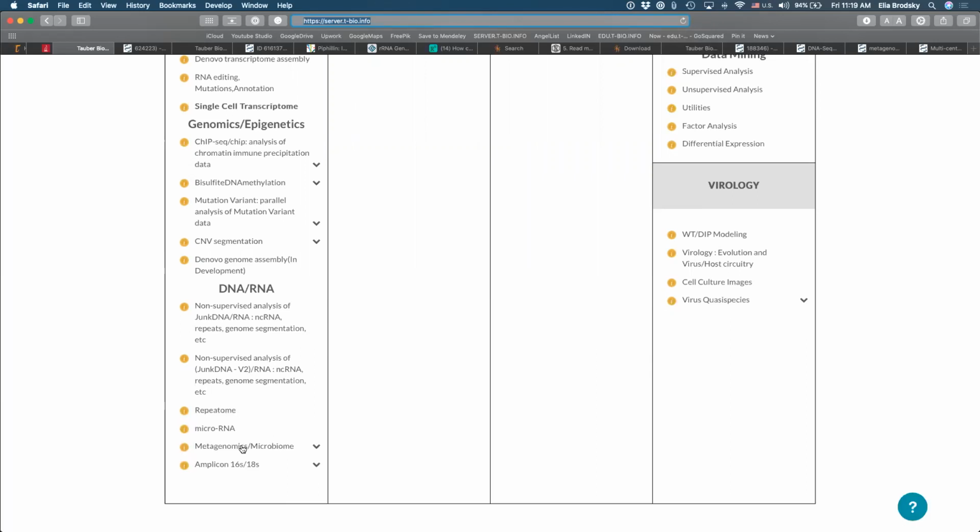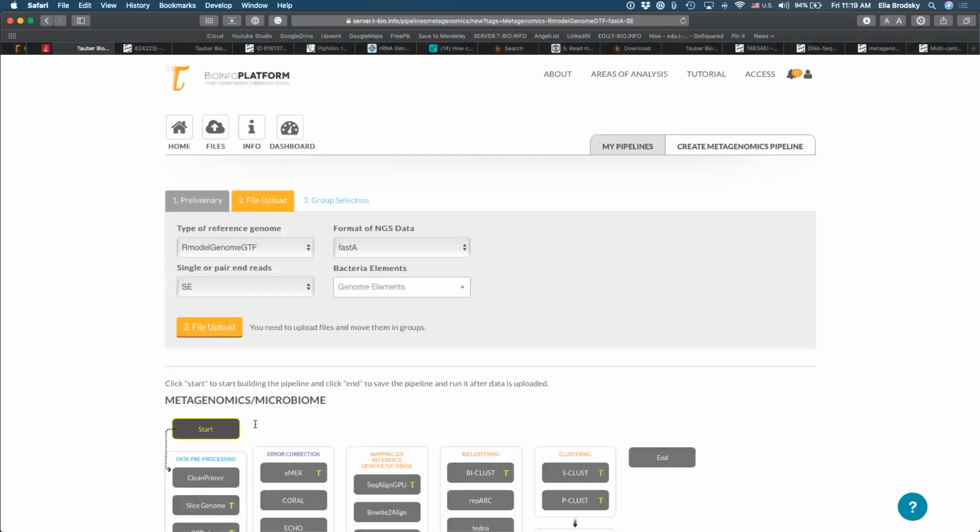Is anyone else here following along? Just want to make sure that we're not leaving anyone behind. All right, great. So here we go. And now we need to make some selections about our data. So what do we put in our reference genome?